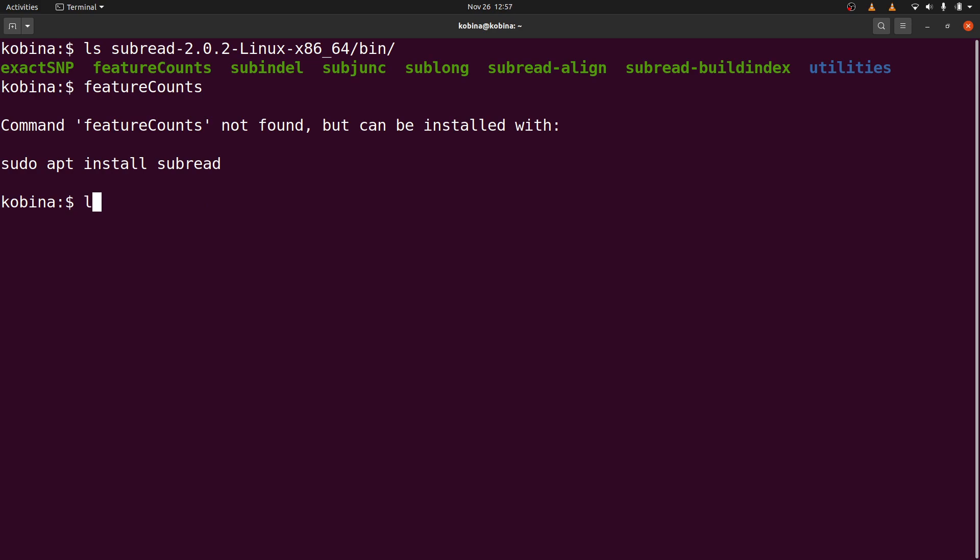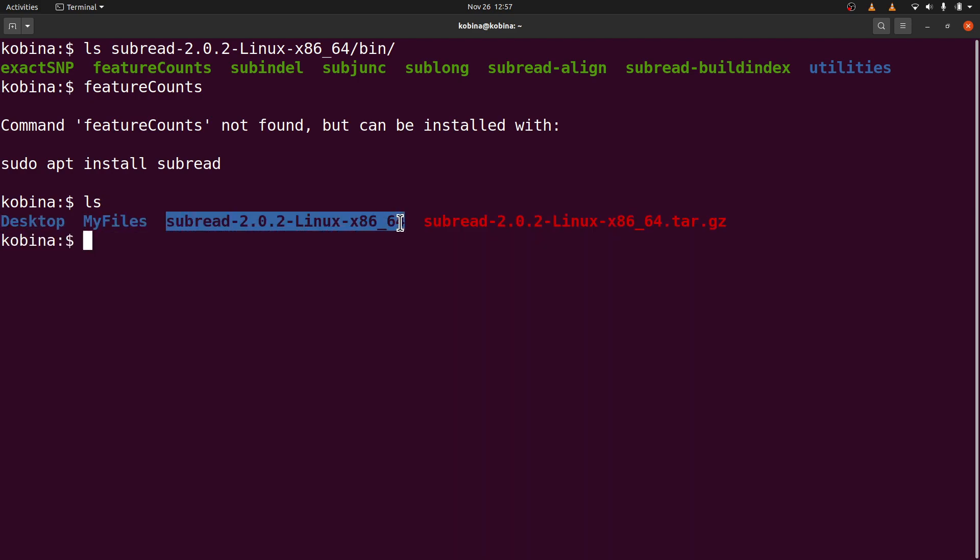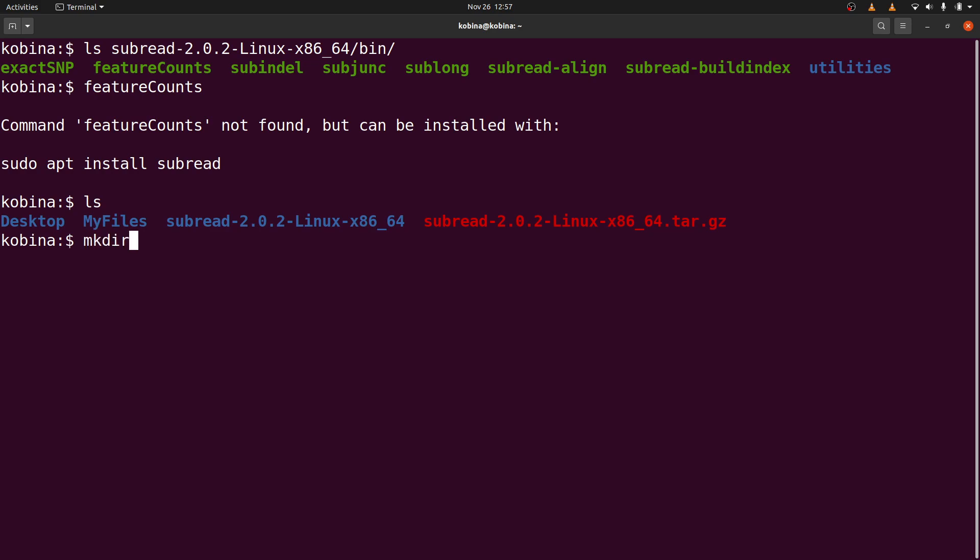So first of all, let's do an ls again. We are going to first move this directory. For me, I have a directory that I always install my packages in. So I have a directory where I save or store all my packages, my software, my tools. It helps me to organize. It helps me to kind of separate my tools from other files on my system. So what I'm going to do here is to create a directory called apps.